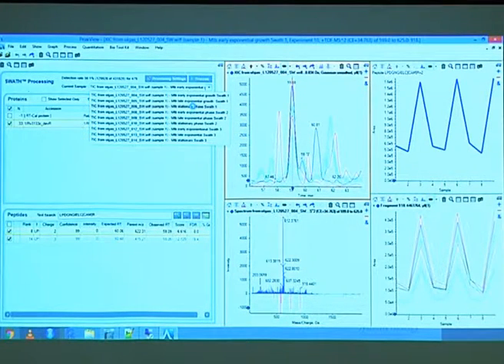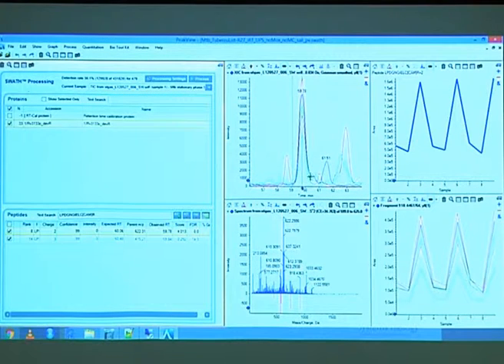If I go to the stationary file and look at that, you see that peak here increases, and that little shoulder peak stays in the same intensity range, so it's much smaller. So like this, you can also see when a peak is actually an interference.